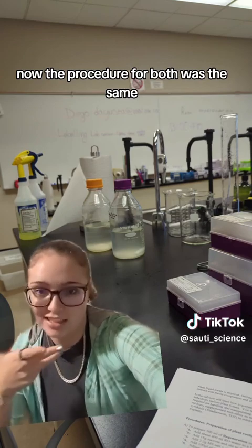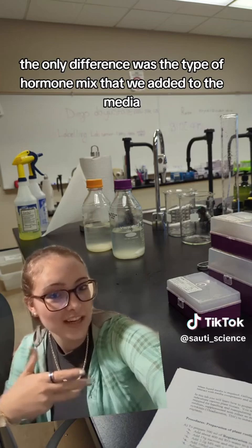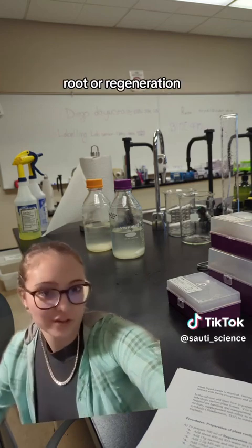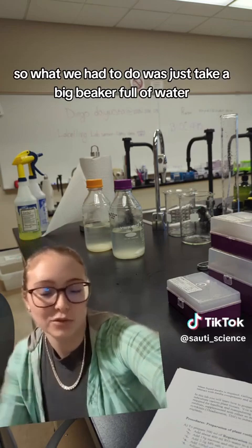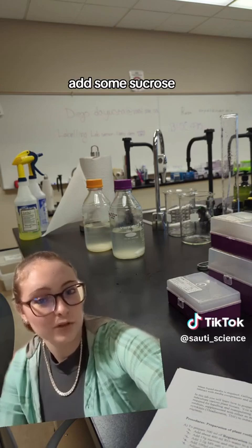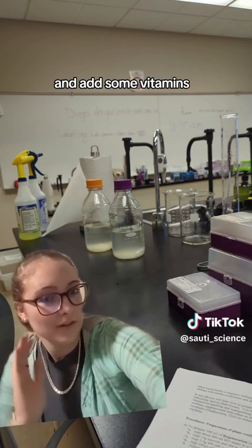The procedure for both was the same. The only difference was the type of hormone mix that we added to the media to help with the different things each medium was supposed to do — root or regeneration. So what we had to do was take a big beaker full of water, add some sucrose, add a salts mixture for nutrients, and add some vitamins.